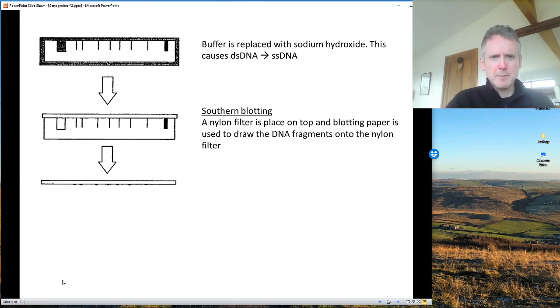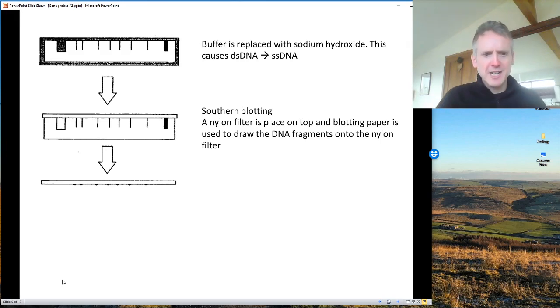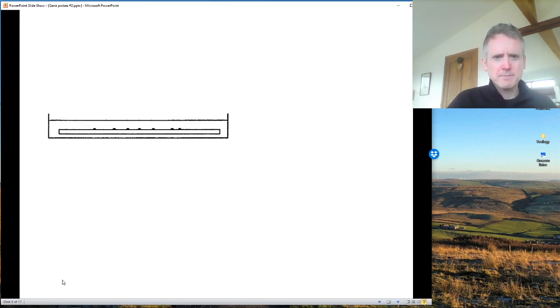It's placed on top. We put blotting paper on top, and that draws the DNA fragments onto the nylon with the code sticking out into space with the sugar phosphate backbone attached to the nylon. And then that's held on with static. So then you bake it in an oven, which makes the sugar phosphate backbone stick into the nylon, and the bases stick off. So that's a permanent way of getting the DNA fragments.